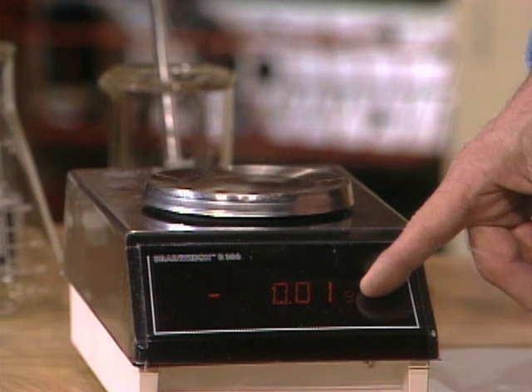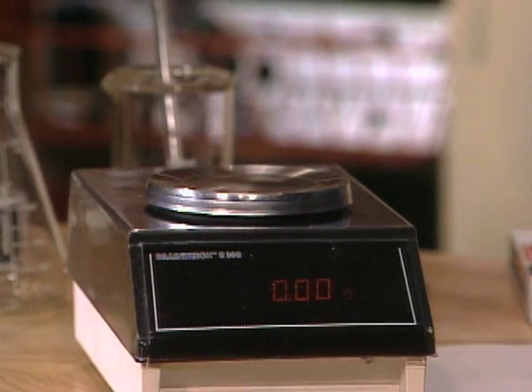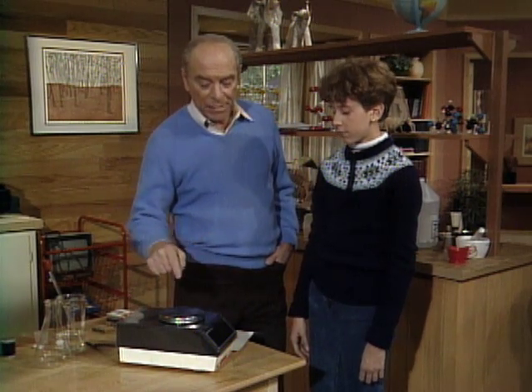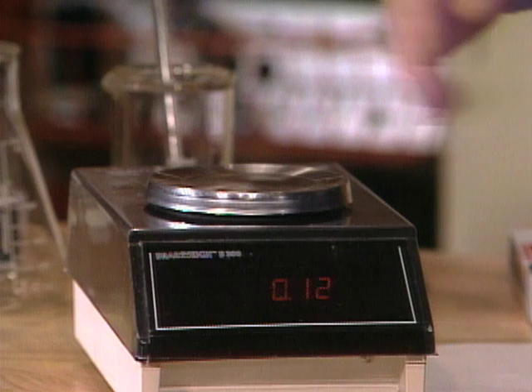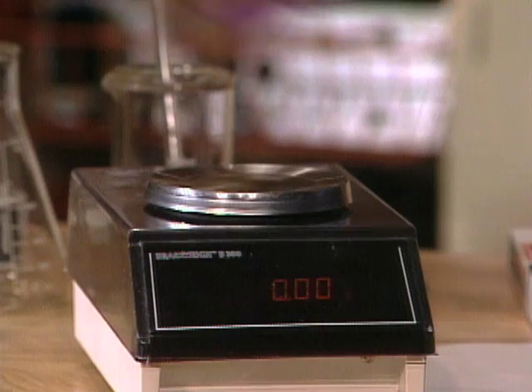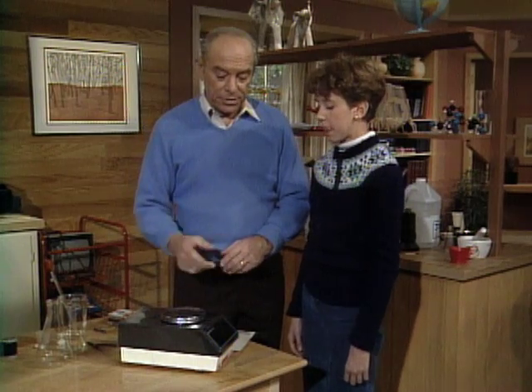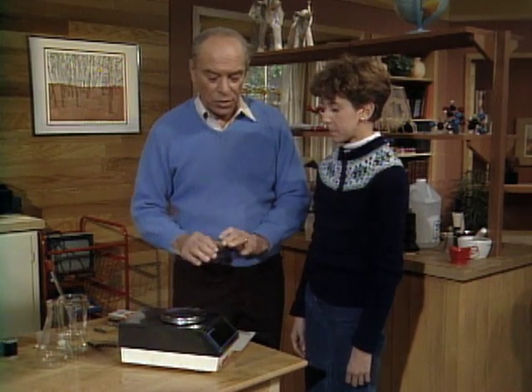Right now it needs zeroing. See that bar down there? We'll push that one bar. It was jumping around — well, it's very, very delicate. Watch, I'm going to wave my hand at the pan up above. Oh, it went up to about 0.12! Just the air moving against it can do it. So they very often put it in a glass cabinet so that the air currents can't affect it. That's why it's such a challenge to work with one of these.